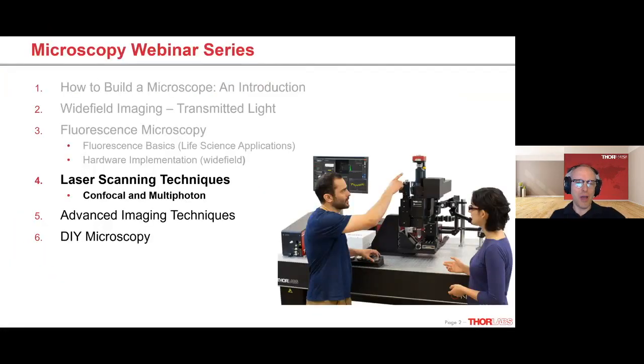So today we are talking about laser scanning techniques with a particular focus on confocal and multiphoton. This is the fourth talk in our webinar microscopy series, and we'll build upon the concepts described in the first three talks. Those talks can be found on thorlabs.com/webinar if you'd like to go back and review them after this talk. There are two further talks in this series that will build upon the concepts described thus far. The next talk will be on advanced imaging techniques, where the Thorlabs Imaging Systems Division is going to describe some of the new technology development in this area.